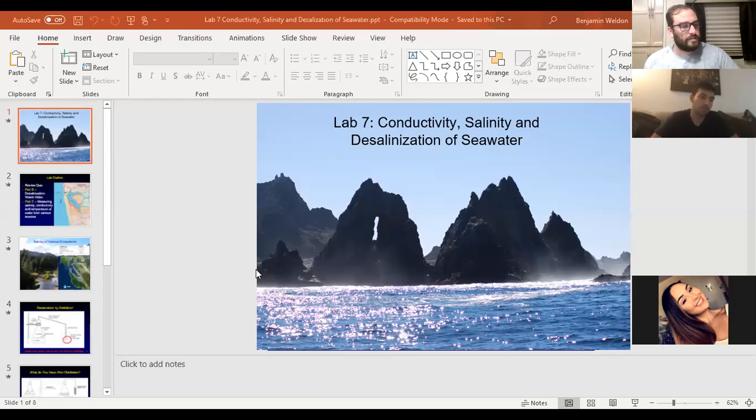Okay, so I'll go ahead and get started. Everyone should have taken the pre-lab quiz and turned in the lab from last week. Like I said, this should be a shorter lab. It's called Lab 7, and we're going over conductivity, salinity, and desalinization.